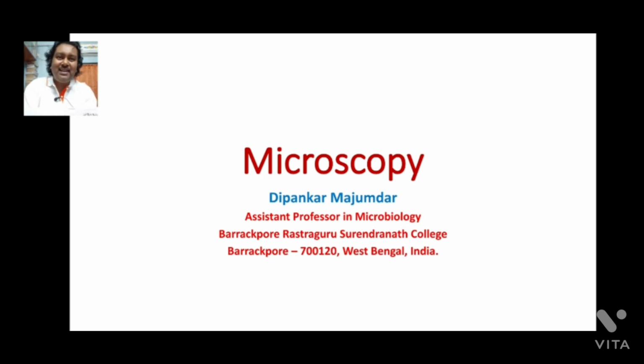Today I will discuss the most required and basic instrument to study microorganisms, that is, microscopy. Sight is humans' dominant sense, and the sensory world is primarily a visual one. Magnifying lenses, microscopes, and telescopes provide an extension of humans' visual sense.